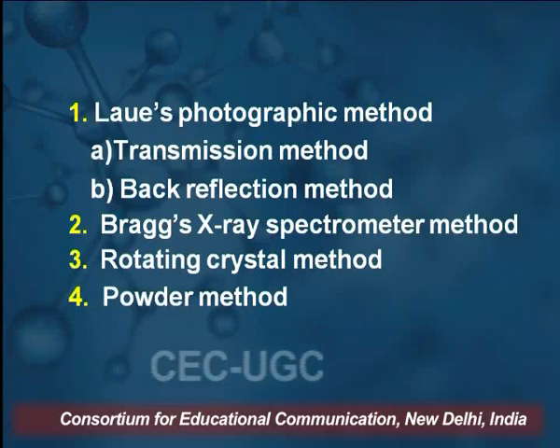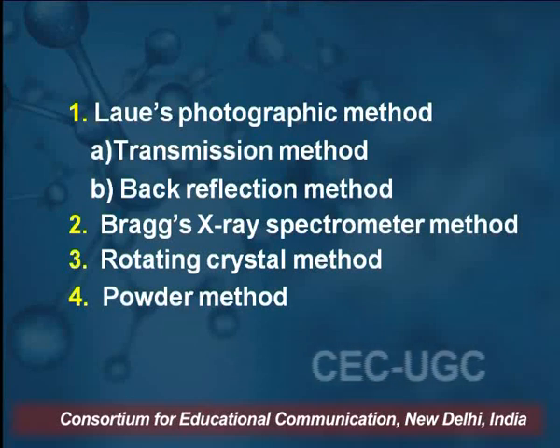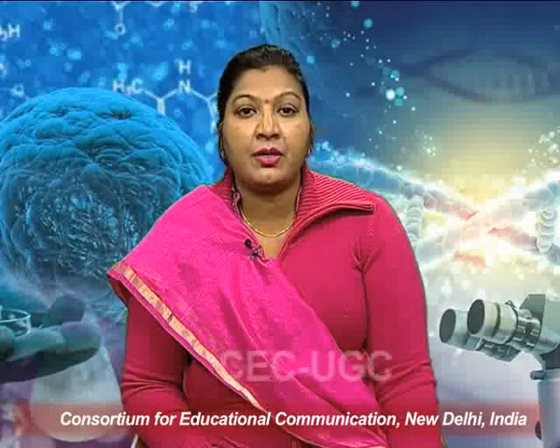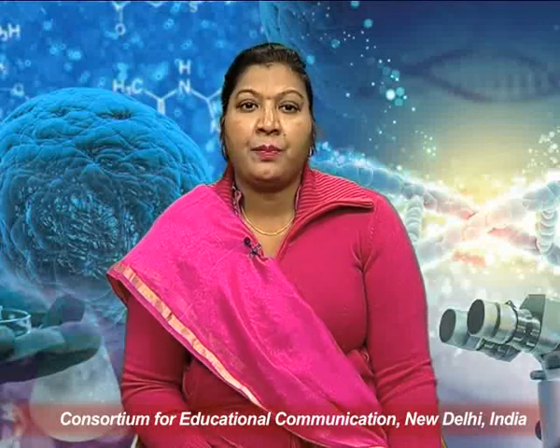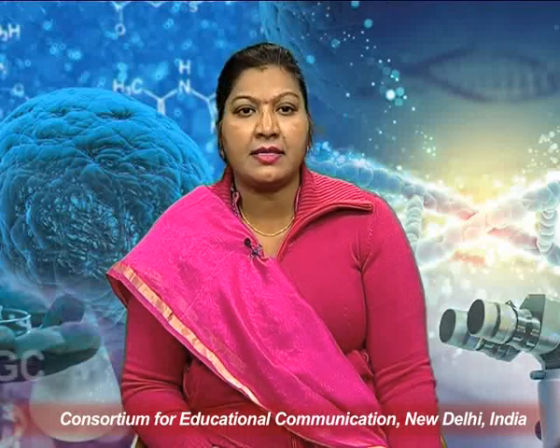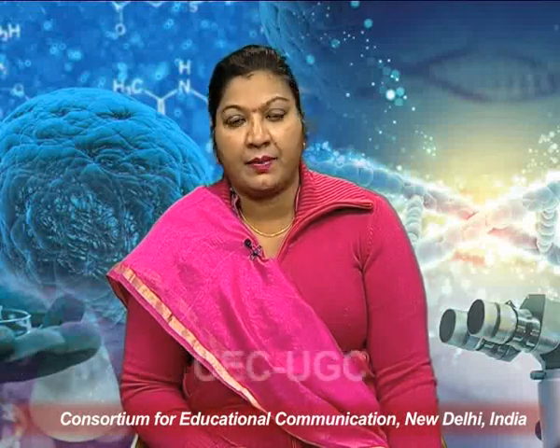The fourth method, which is very important and commonly used for X-ray diffraction, is the powder method. As the name suggests, the sample is used in the form of powder. So there are 4 methods, of which 2 are very important and most commonly used for the characterization of nanomaterial: the Laue photographic method and the powder method. We will discuss them one by one in detail.